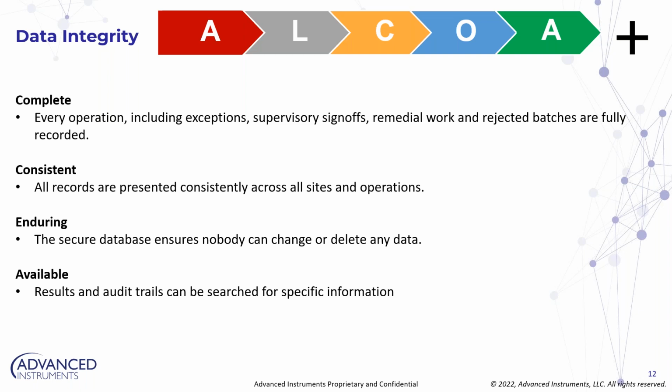The next one being enduring. And enduring is something that I think everybody understands very quickly, because anything that we do, we do it for a long term. We need to have copies for many years. So is that database with the data secure? Now, if you are backing up the data to your cloud or your LIMS system and things of that nature, that's exactly the same thing, right? What's important is that LIMS system is able to securely save that data for an extended period of time.